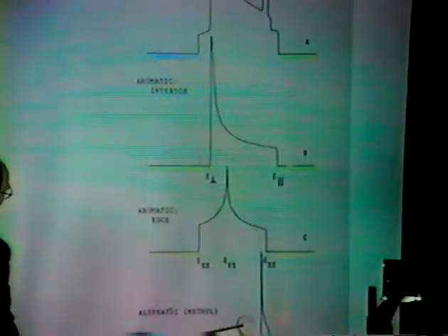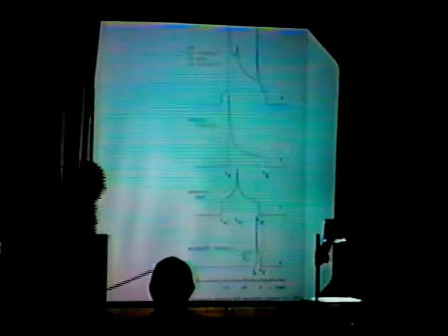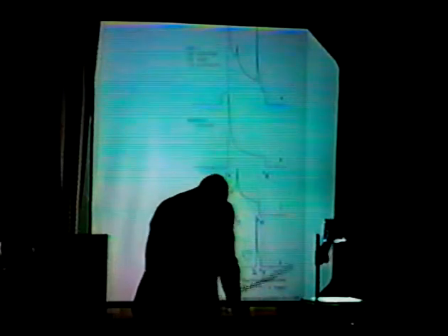And you might even have a little bit of aliphatic stuff that you have to add in, and you get some patterns that look like this. Then when you put in an appropriate broadening, you can probably pick the spectrum that we have for charcoal, and we tried that on another spectrum.